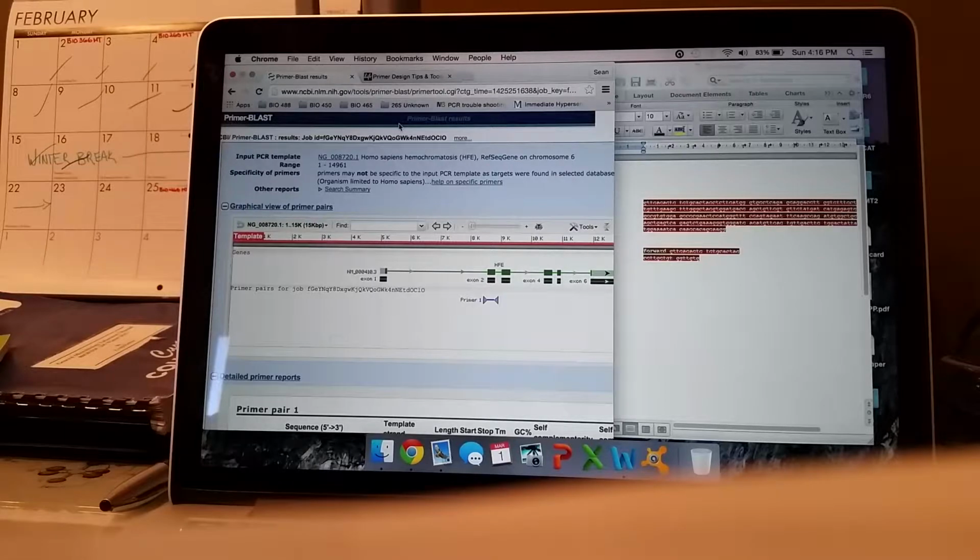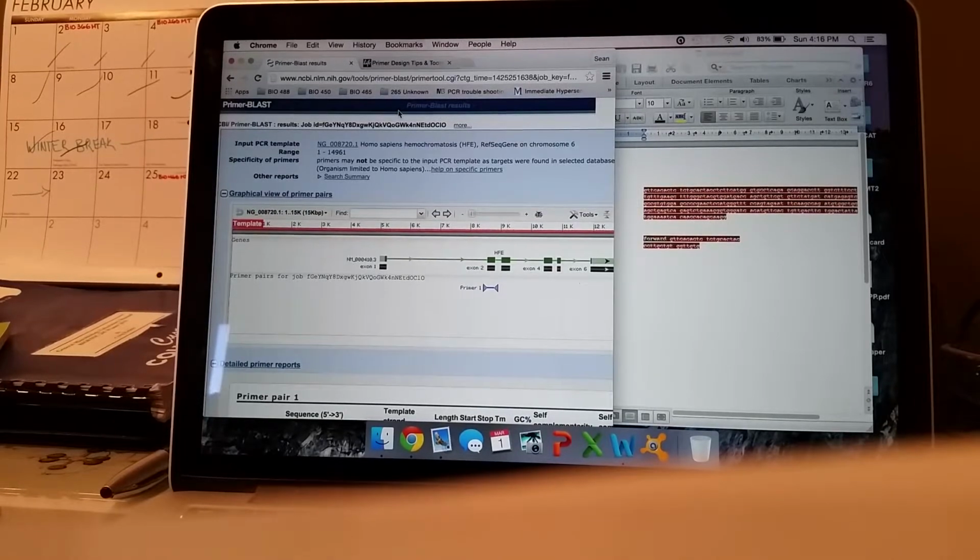So I'm just looking at the other questions really quick. They should be pretty straightforward. Yeah, it's just primers with obvious mistakes. Again, you can go to the Life Technologies website to find out what those mistakes are.